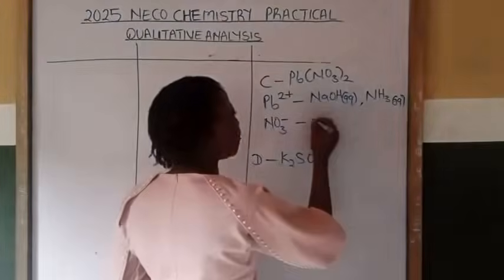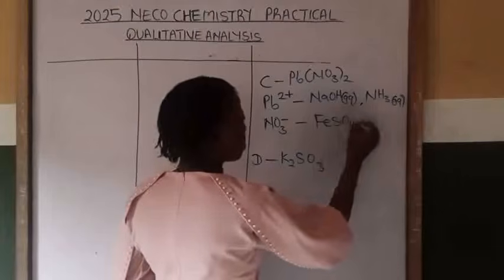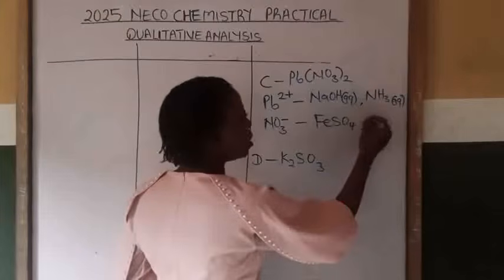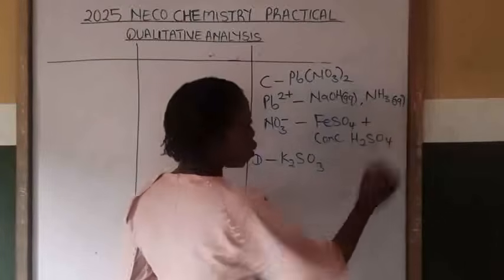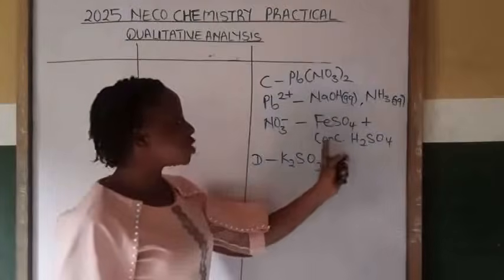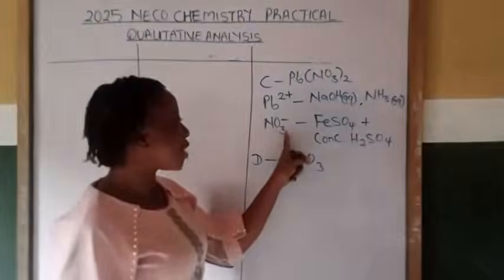So we are going to use freshly prepared iron(II) sulfate and concentrated H2SO4.